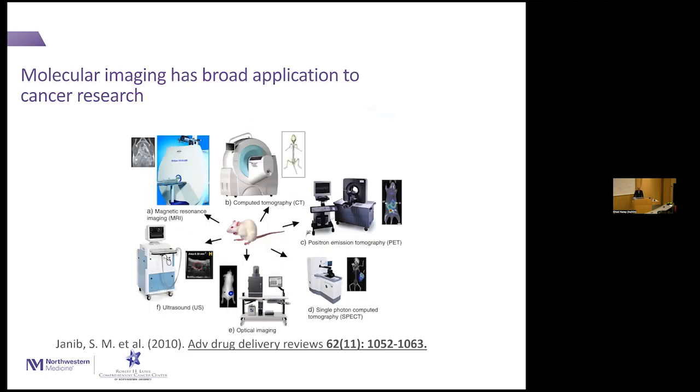So as I mentioned with the floor plan, we have pretty much every preclinical imaging equipment. So if you can imagine what you would see in a hospital, we have the small animal version. The only thing we don't have is ultrasound.